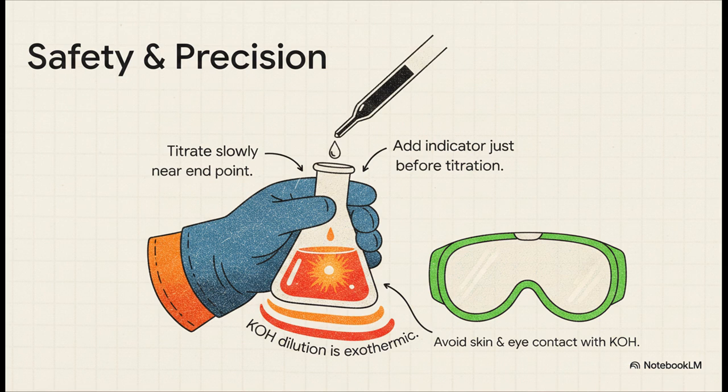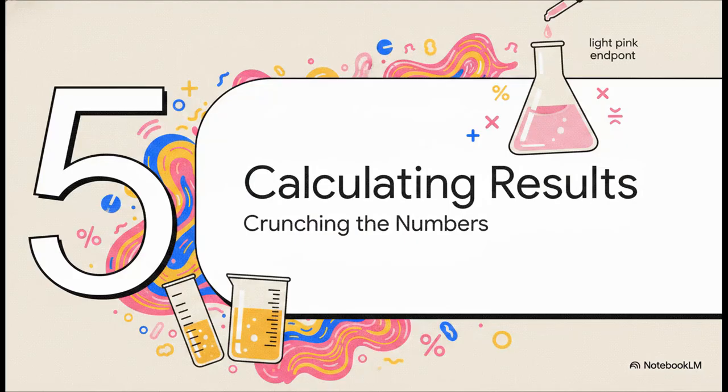And here's a wild detail. KOH dilution is exothermic. That literally means it releases heat. If you're holding the flask, you're going to feel it getting physically warmer in your hand. Okay, the fun part. Part 5, calculating the results.